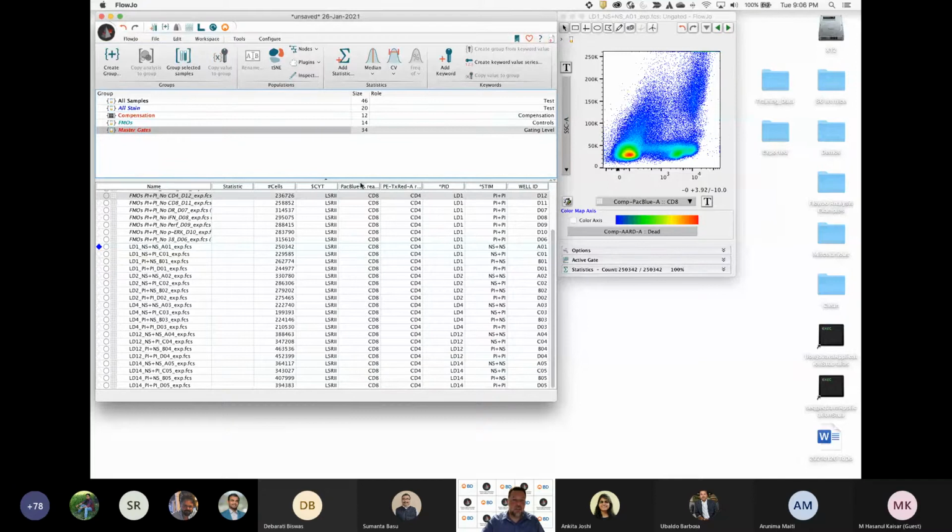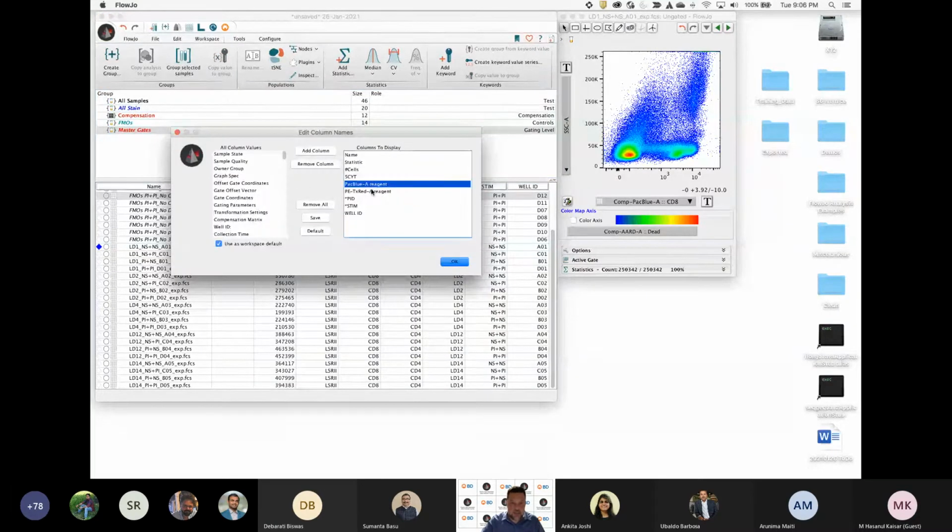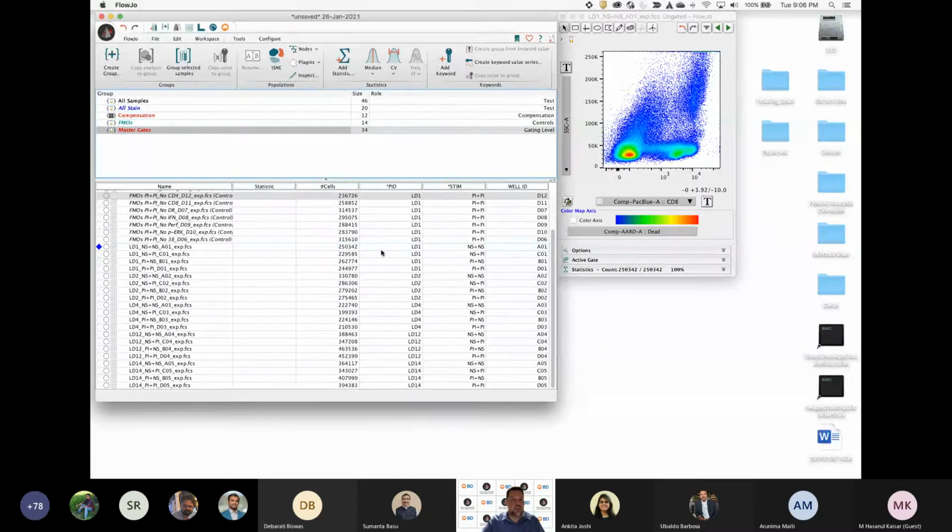Once you've displayed these columns, you can always go back to edit columns, remove them from display, remove columns, and then press OK, and notice the columns have now changed. I usually like to leave pertinent information up and may remove the information if I'm just using it to label an antigen. So that's your basic showing keywords, and that you can actually create these lists.